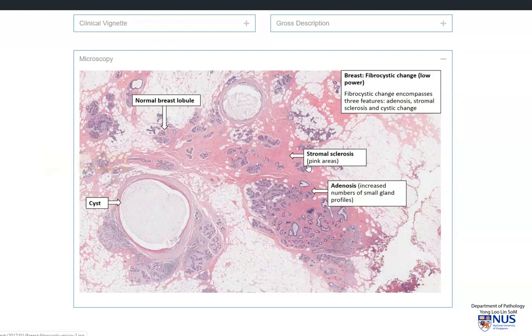The second element that we see is an increased pink area of the stroma, and this is stromal sclerosis or fibrosis. This sometimes may be due to a reaction to ruptured cysts.